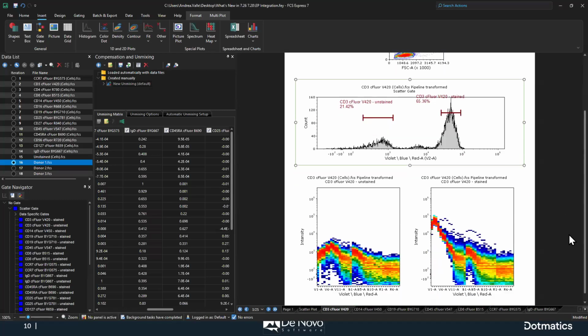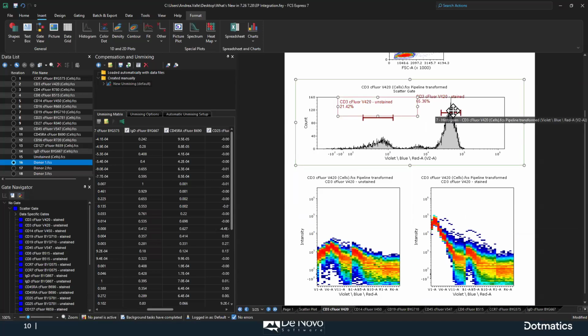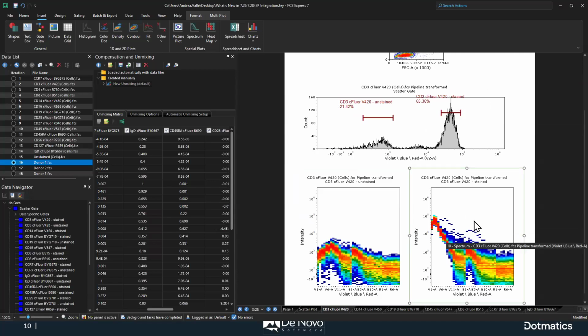And if you are using an external negative, you will only have one marker in this case. And for spectral data, if you're creating an unmixing matrix, you will also see spectral plots for the negative and for the positive as a quality check, okay? If you see extra spectra here, it means that there is probably a cross-contamination from other tubes. So you might want to get rid of those contaminations and refine the gating or create new gates to identify the right spectrum.